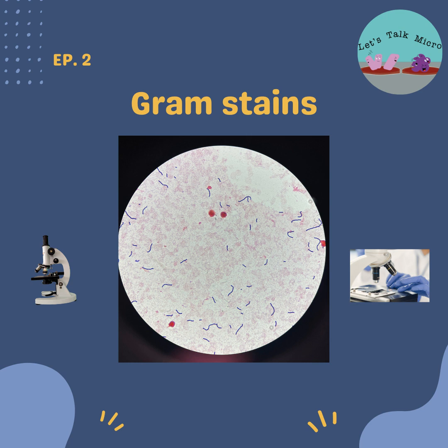Our gram stain has many components, but actually the main ones are four. You have your primary stain, which is crystal violet. You have your mordant, which is iodine.